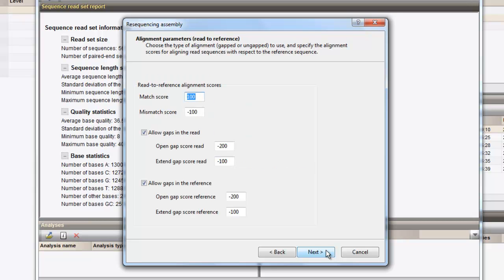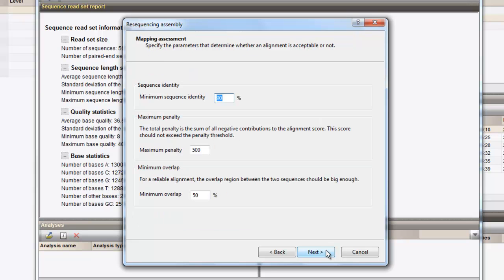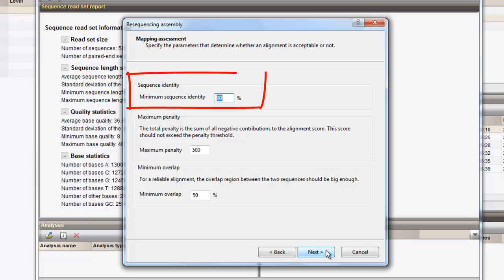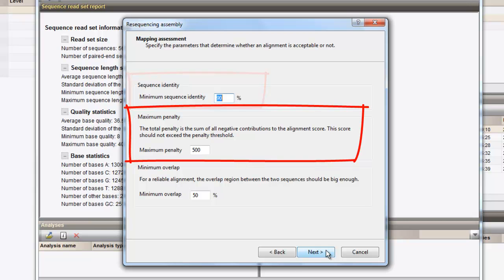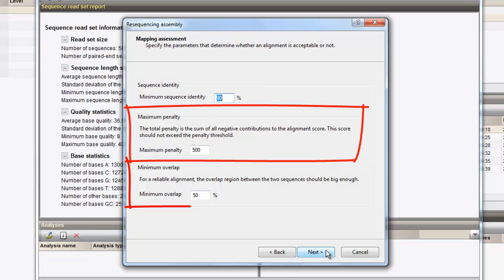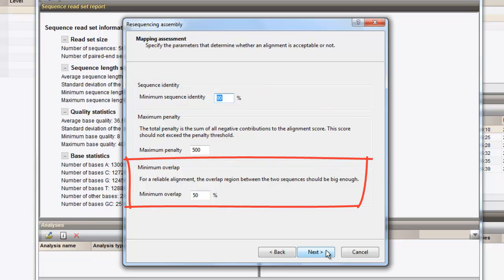The first step in the resequencing assembly is the alignment of the reads to the reference sequence. We can leave all settings default and proceed. Once the alignment of the reads is calculated, the mapping is assessed. Parameters used for this assessment are the sequence identity, the maximum penalty score, and the minimum overlap region for the alignment. For this analysis we can leave all settings at their default values and proceed.